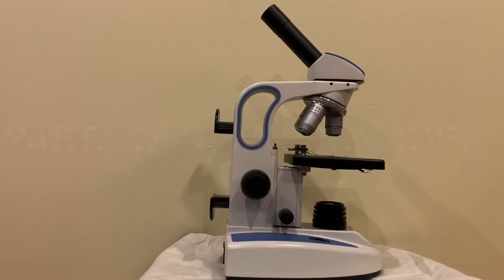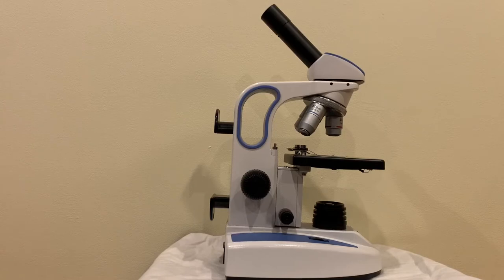This is a compound light microscope. You may recognize it from our classroom.